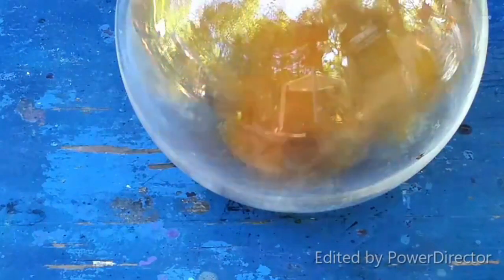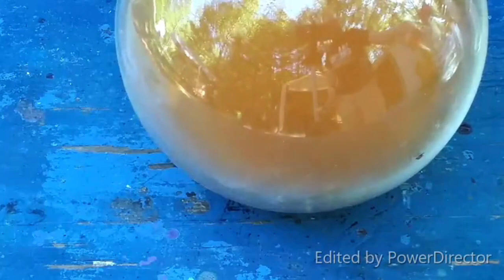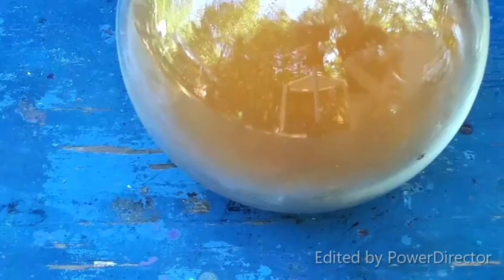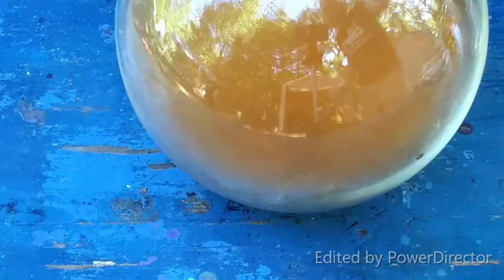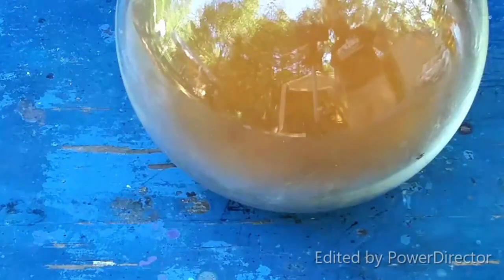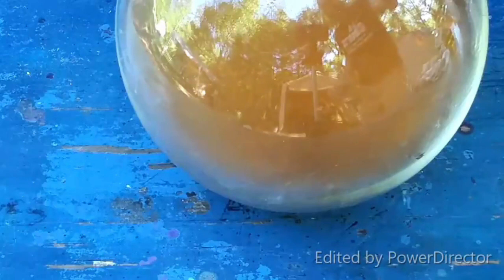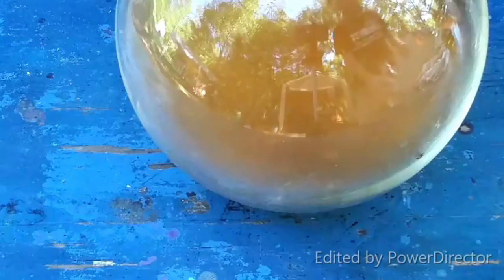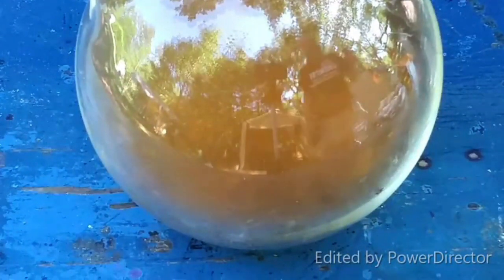Oh, there we go. That did it. That was red fuming nitric acid, by the way. A lot of oxides of nitrogen, which is only to be expected. Adding in dilute nitric acid to just dilute things down. Well, that was fun.